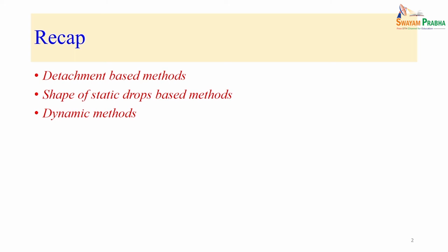And we will also quickly see, if it is not a solid surface but a powder, and you want to estimate the wettability or contact angle on a powder, then we will go for the capillary methods or the column methods. And finally, we will see the difference between the static contact angle and the dynamic contact angle. Also, we will see contact angle and the spreading or wetting of a surface.